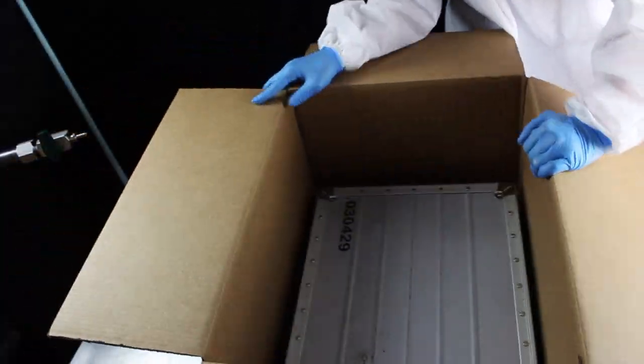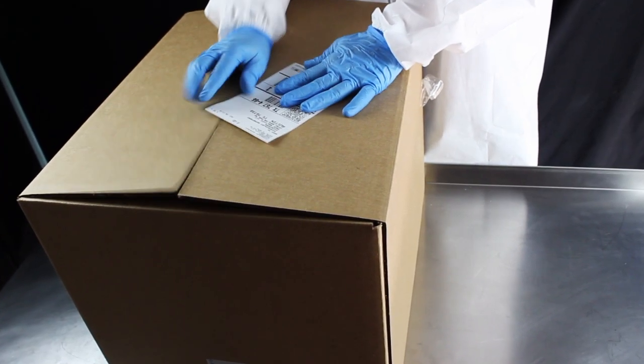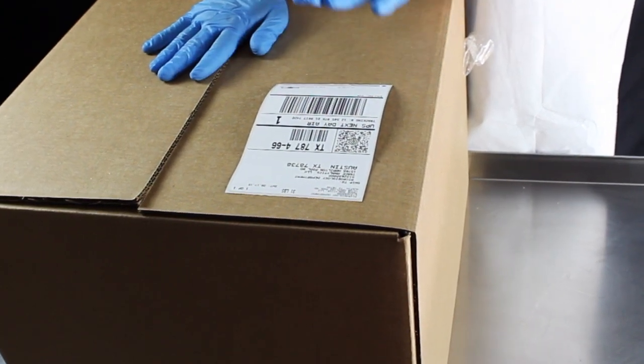Start with the large box. After inserting the aluminum case, make sure the equipment shipping label is placed on the outside of the box.